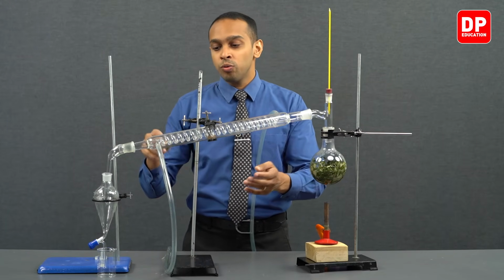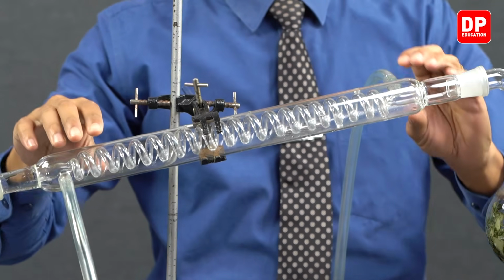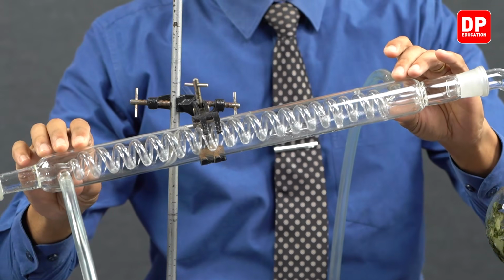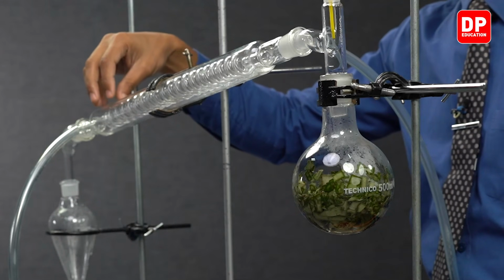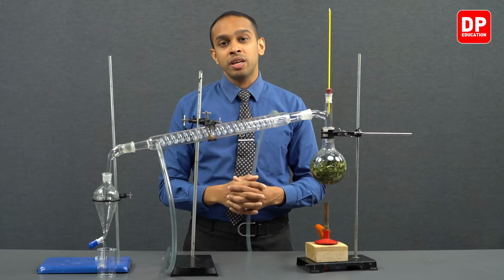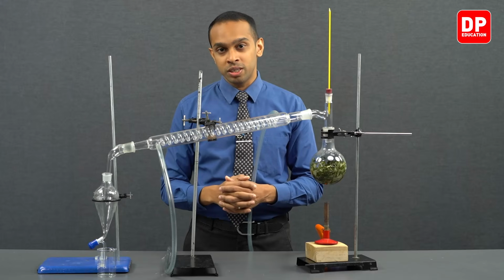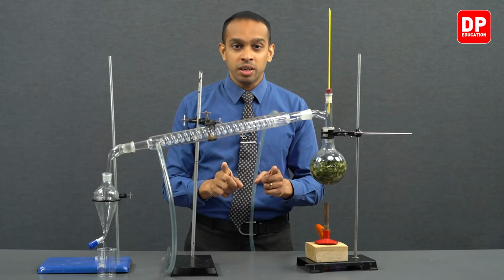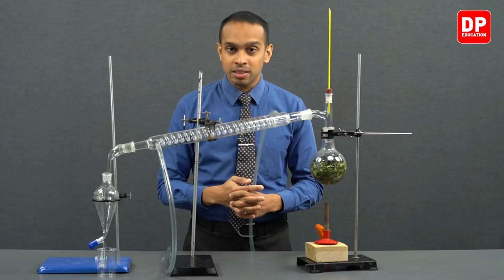Apart from that, when water is moving from the bottom all the way to the top, you will see that this condenser fills up easily, and the hot vapor is always in contact with cold water, making sure that the heat transfer is maximized.